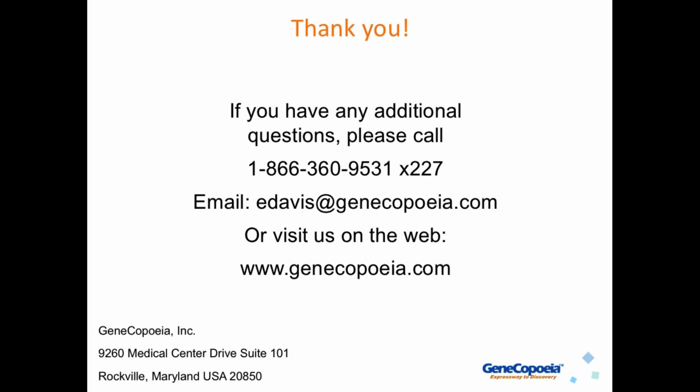Next question is, how leaky is your Tet inducible system? Well, we actually don't have that. The Tet induction system I mentioned is not ours. It's from a published paper. We don't sell the Tet induction system, so I can't really comment on that. I know the Tet system can be leaky, but again, I can't comment on that.